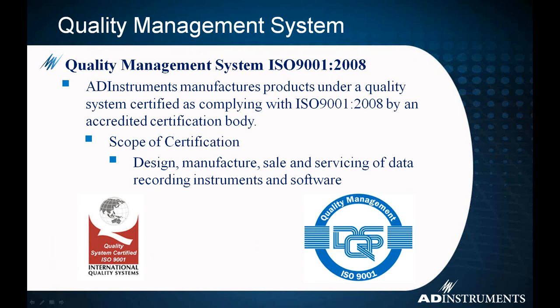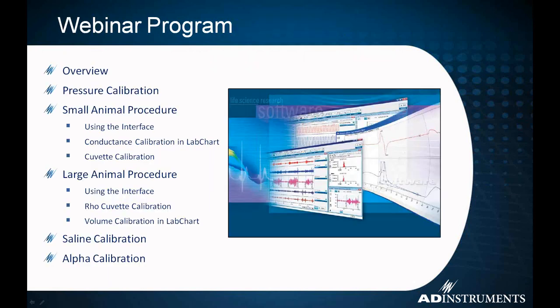So quite often if you have some sort of lab review talking about your experimental protocols, they'll ask for documentation for certification that the products you're going to be using have been produced to a known good standard. We actually provide our certificate on our website for this quality management system.